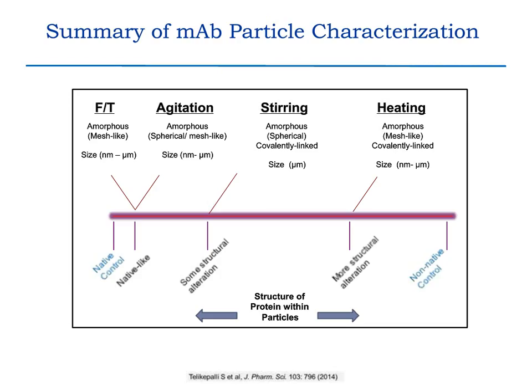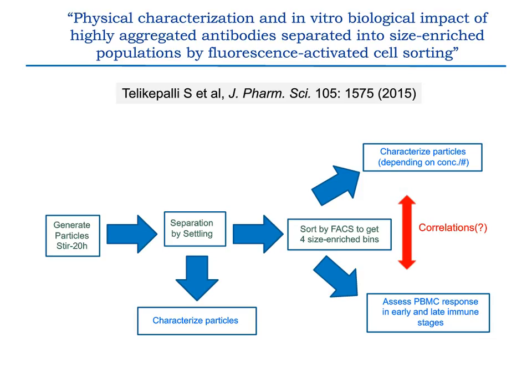Now, we've taken this work one step further in a paper that's recently been published in JPharmSci in 2015 to look at one aspect of these subvisible particles in more detail. This paper is entitled Physical Characterization and In Vitro Biological Impact of Highly Aggregated Antibodies Separated into Size-Enriched Fractions by FACS. So in this study, we generated particles by stirring. We settled the particles, and we characterized them, as shown in the flow sheet. We then did a FACS separation to separate the proteins by size, and then we assessed their biological activity as well as the physical chemical nature of the particles.